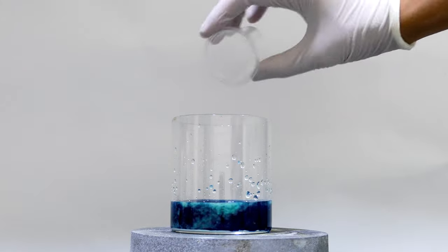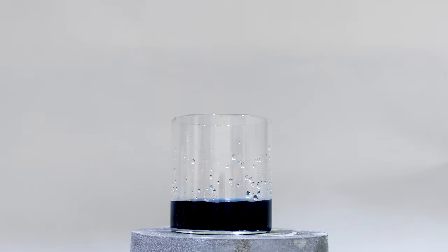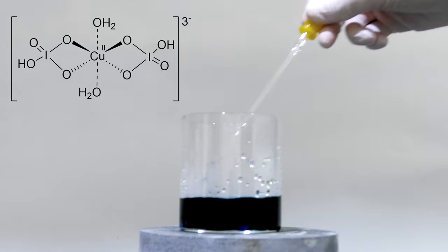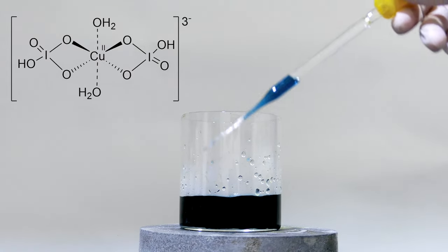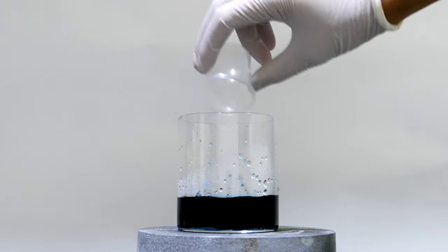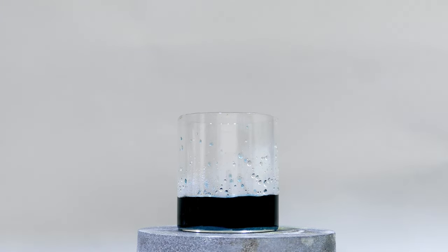After that, 5 grams of potassium hydroxide is added as a solution. Upon addition, the contents of the beaker turn into a deep blue color. Then the chemical, which is 5 grams of potassium persulfate, is added, and the heat is turned on.